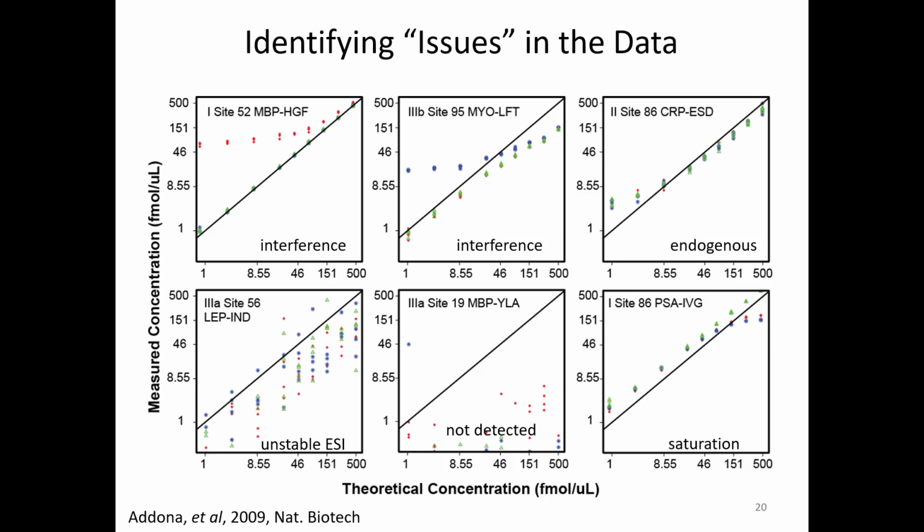Yeah, so another potential for optimizing collision energy is, this is rare, but if you have something co-eluting with your peptide that's the same mass to charge but maybe a different charge state, it will co-isolate, and no matter what mass analyzer you use, it'll co-fragment. However, it may have a different optimal collision energy.